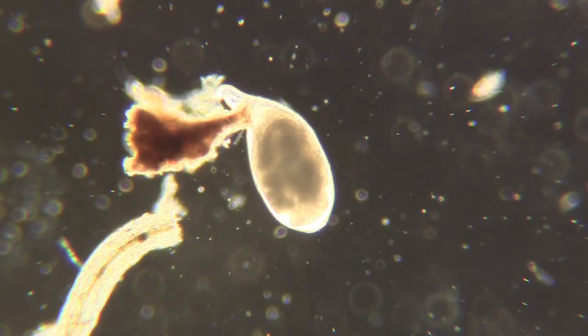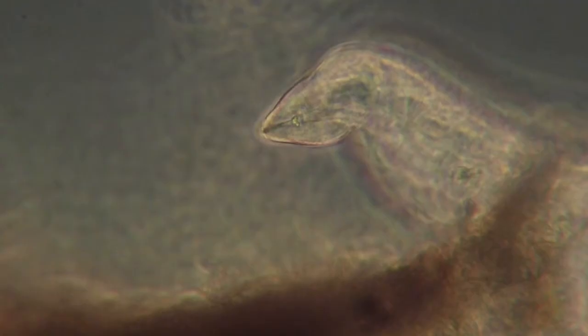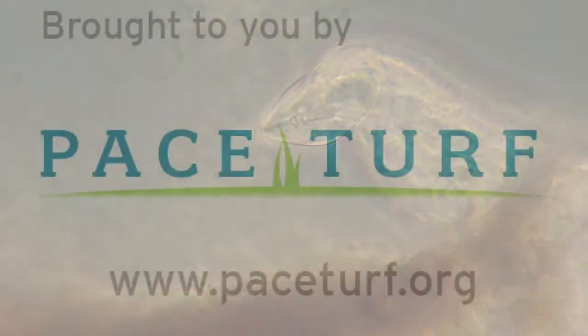Here's what we see on low power with a compound microscope. And when we zoom in to over 400x, we can see the head — there's a stylet that is typical for Meloidogyne, the root-knot nematode.